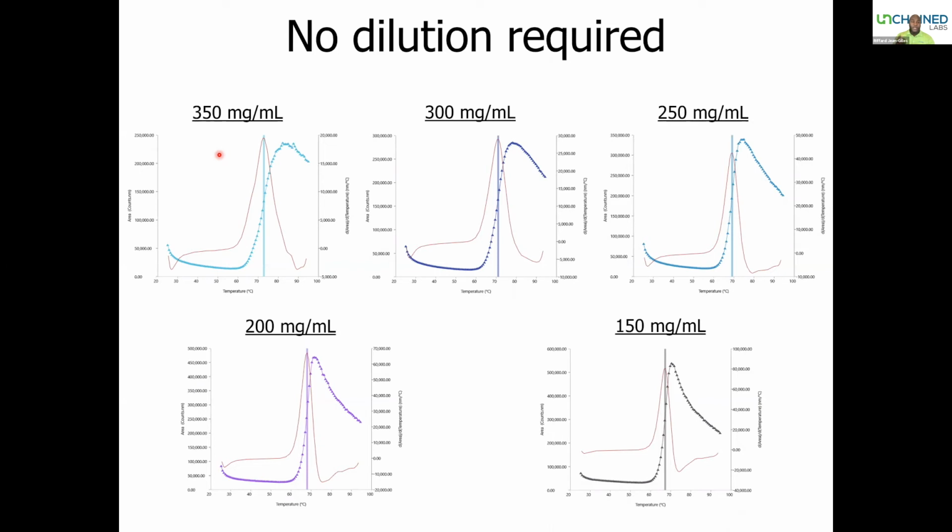So the rather unique raw spectra that I showed you before, with the very unique peaks that you were seeing there, actually is indicative of a very densely packed structure, which ironically enough can either be aggregation or can be actually favorable to you, because it appears to give it a gel-like structure that actually stabilizes your structure. So it's a rather unique way to think of it. But what we think of as aggregation may not be as bad if it's reversible. In fact, as you dilute your way down, that phenomenon goes away, which is actually good in terms of not having something that's irreversible.